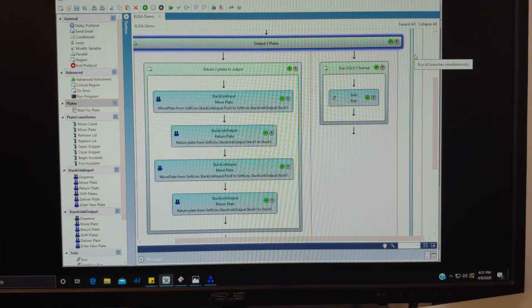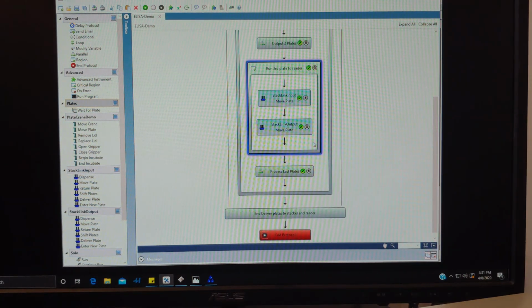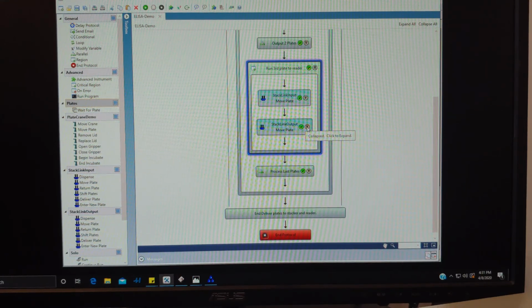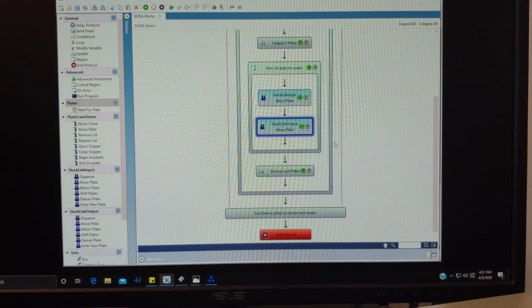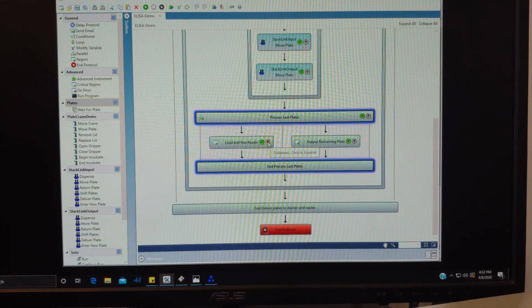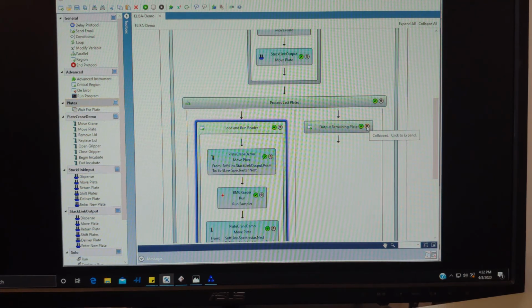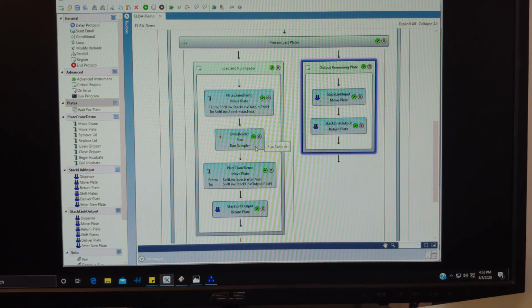The third plate will end up going to a reader, so we'll need to tell the system to act a little differently here. We'll ask the stack links to move the plate to a place where the plate crane, a robotic arm, can grab the plate and load a BMG reader. Once the plate is in position, we'll tell the arm to grab the plate. And then once the reader is loaded, we'll run the sampler protocol.